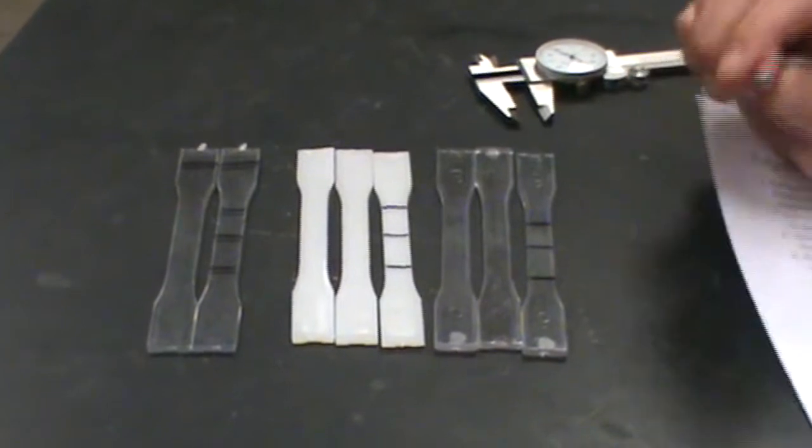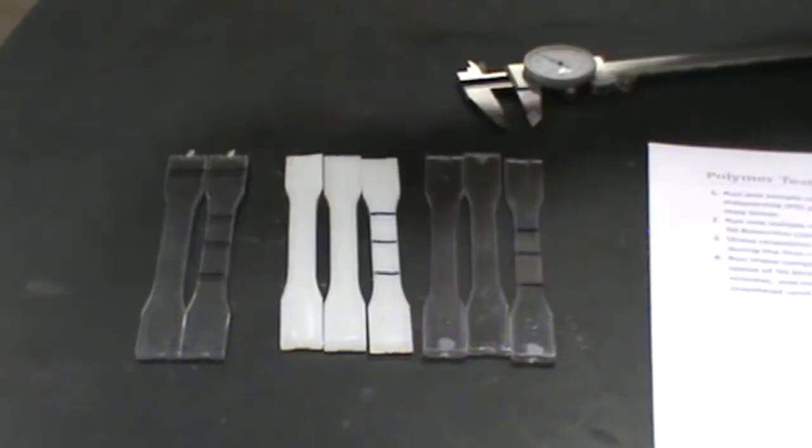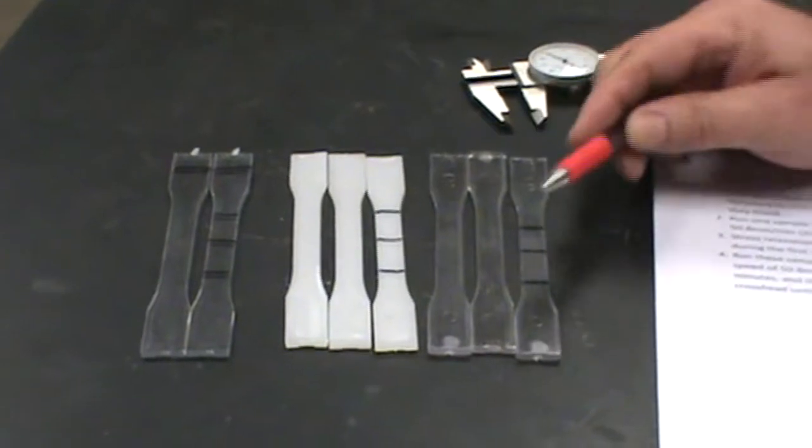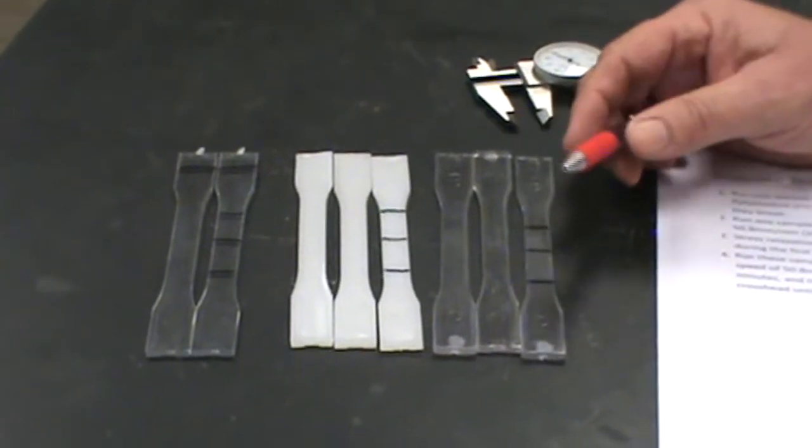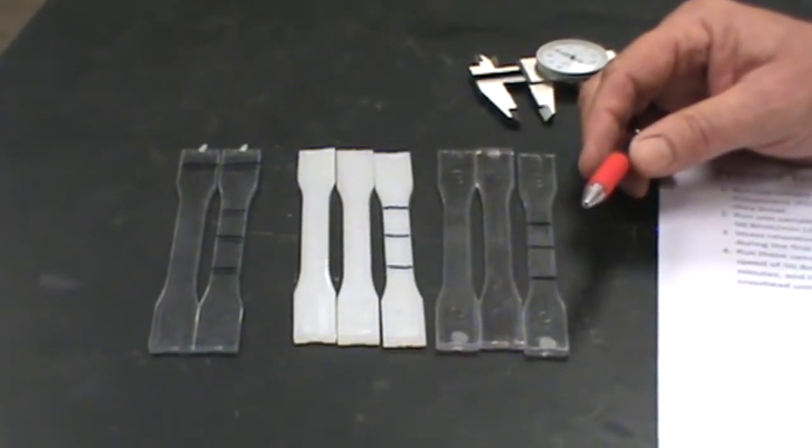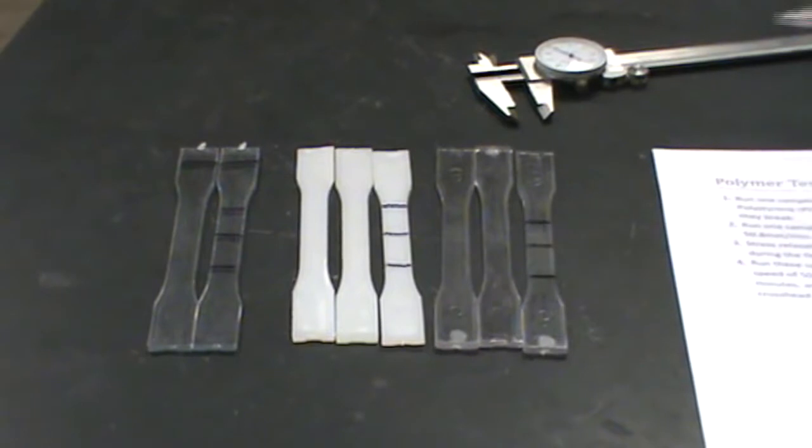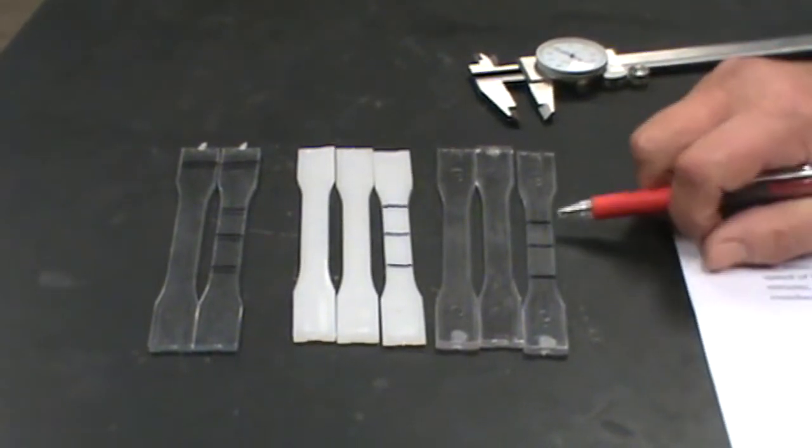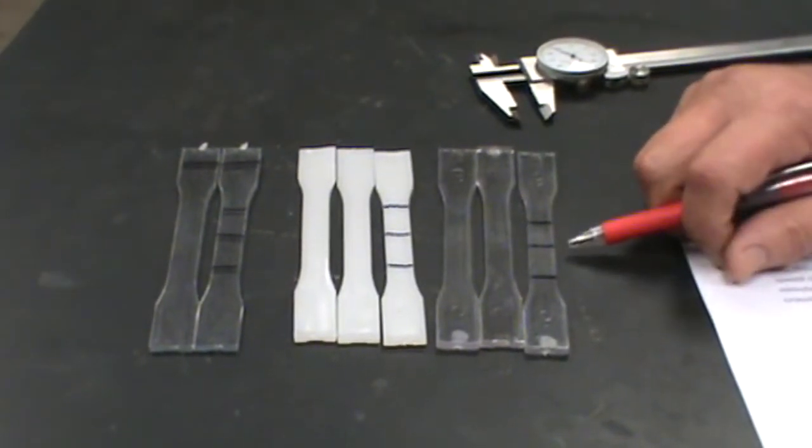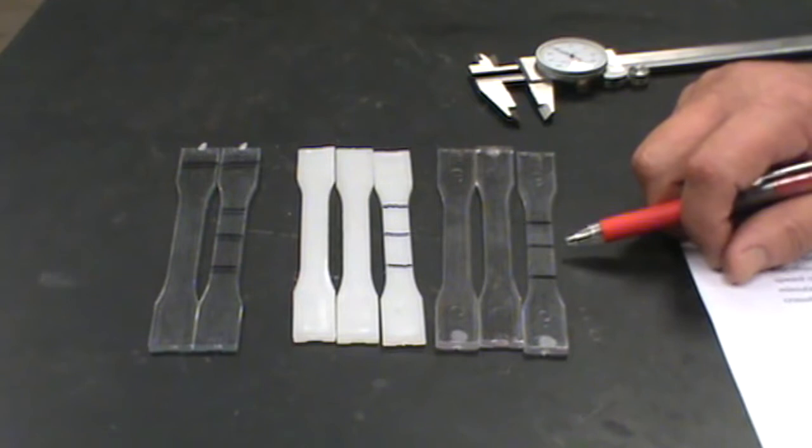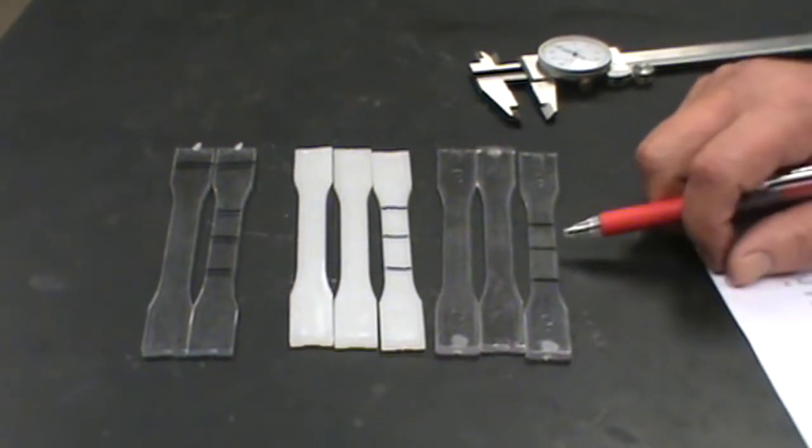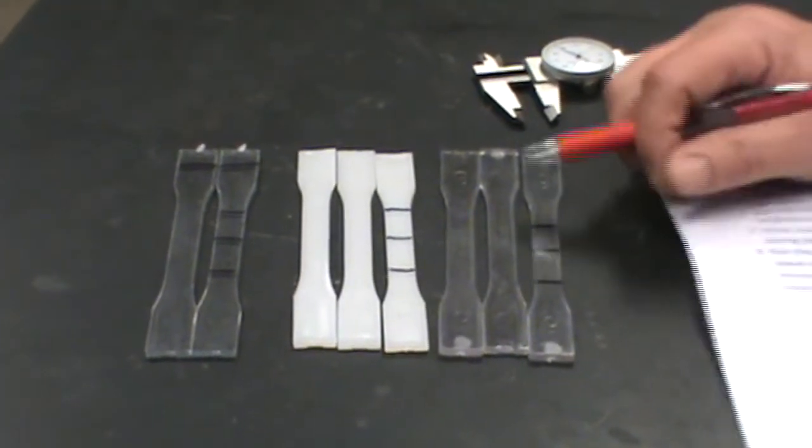You're going to mark up all your specimens because you're going to break every one of these. Then after you get done breaking them, you have to put them back together and re-measure them. So what you need to do is measure your gauge length, your thickness, and the width of your specimen.